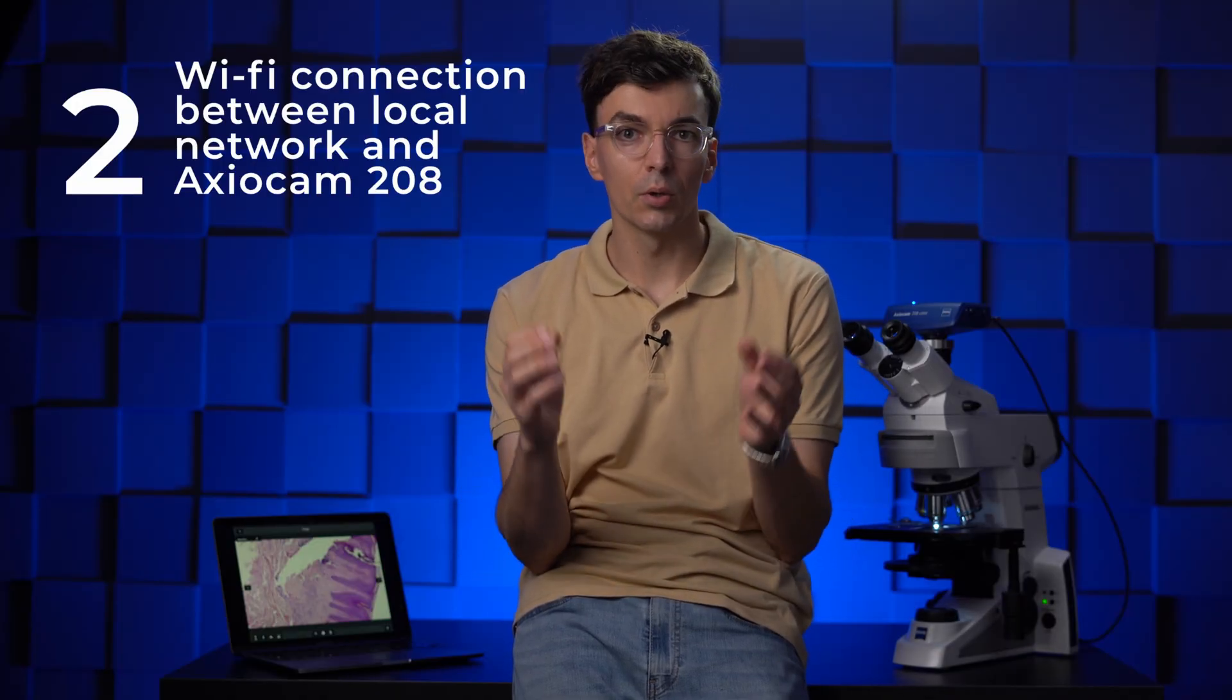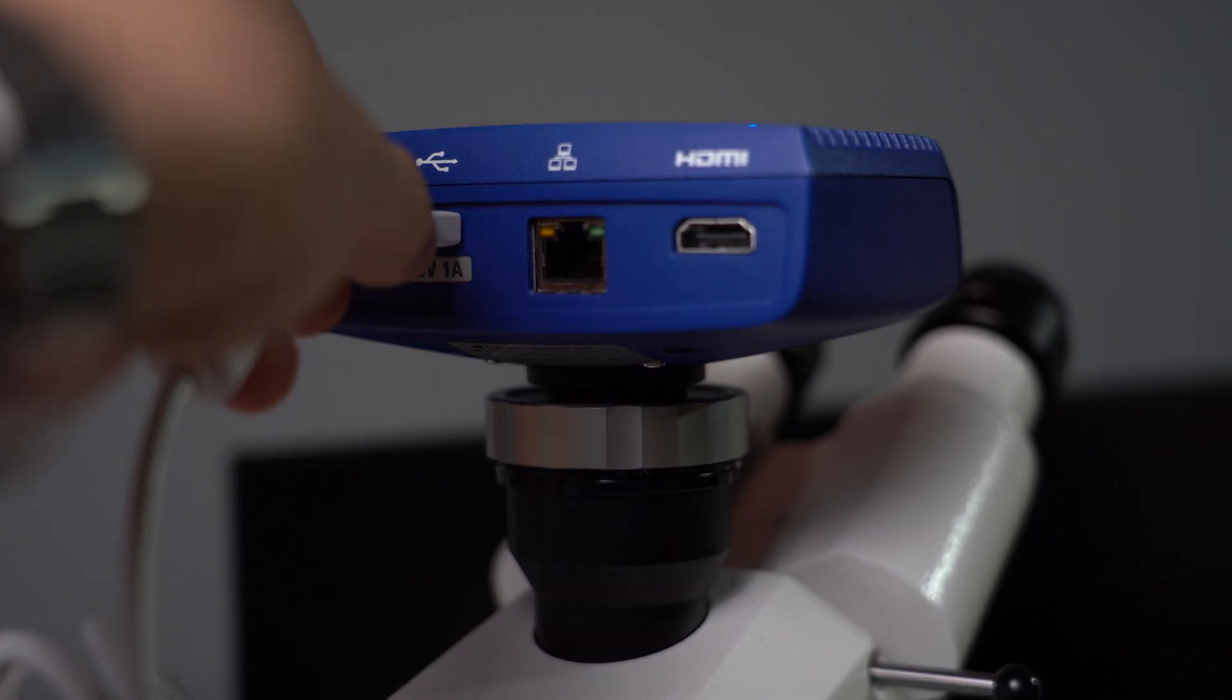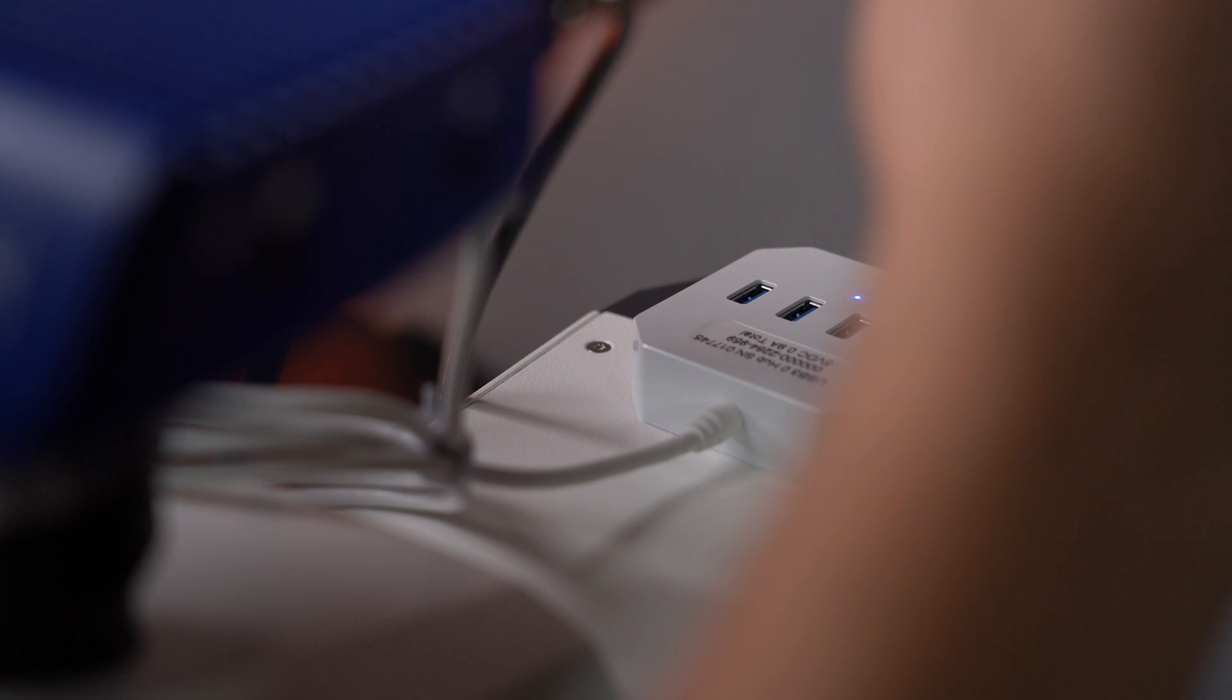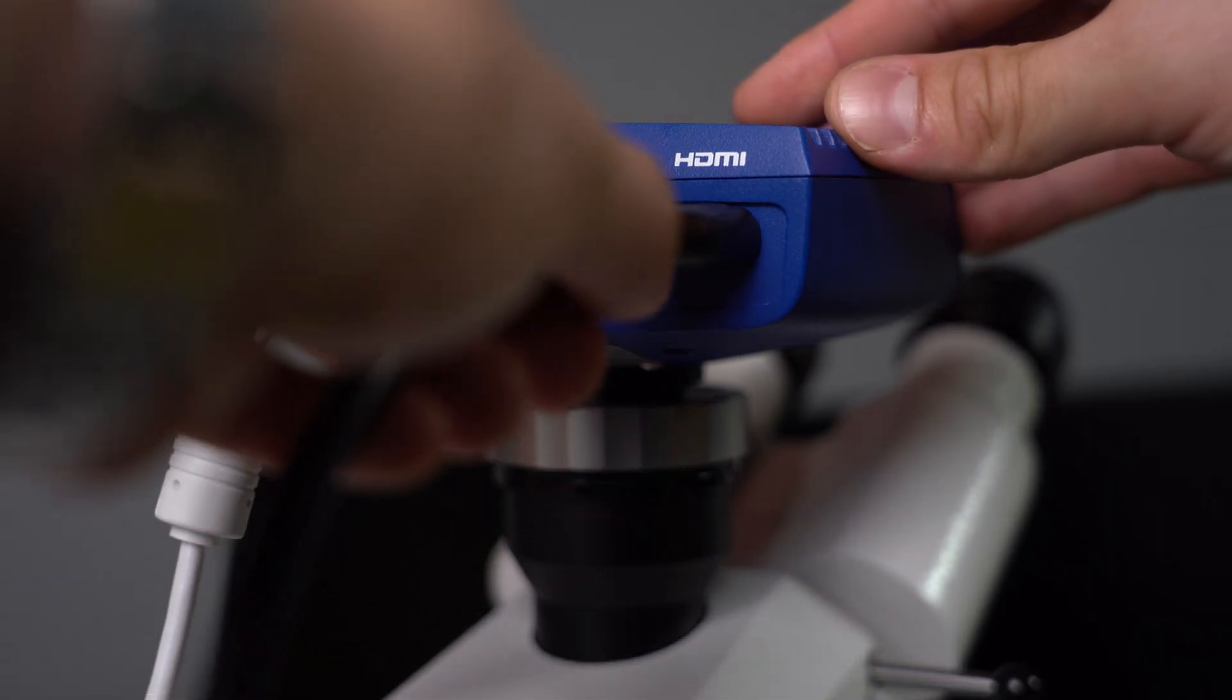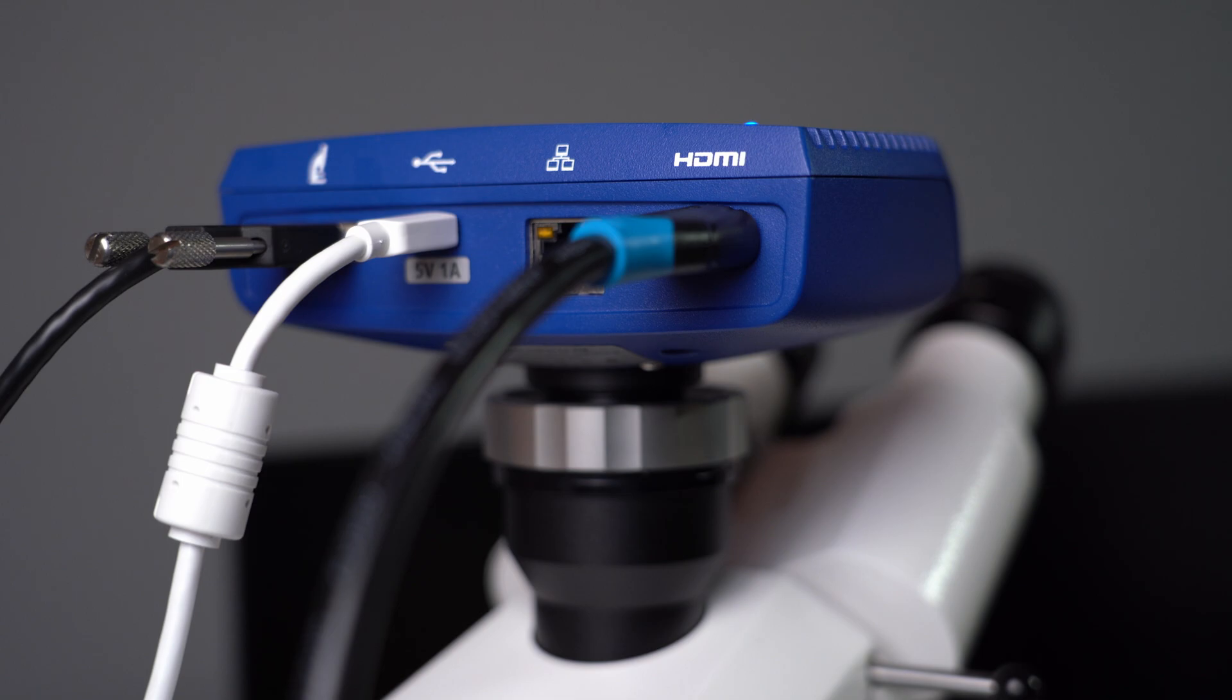The second option is similar but we will use a Wi-Fi connection between your local network and Axiocam camera. First of all, connect the USB-C hub to the camera and plug in your Wi-Fi adapter and mouse to the hub. After that we need to connect the camera directly to the monitor using an HDMI cable.